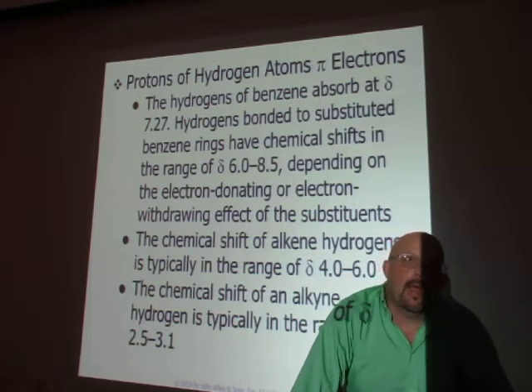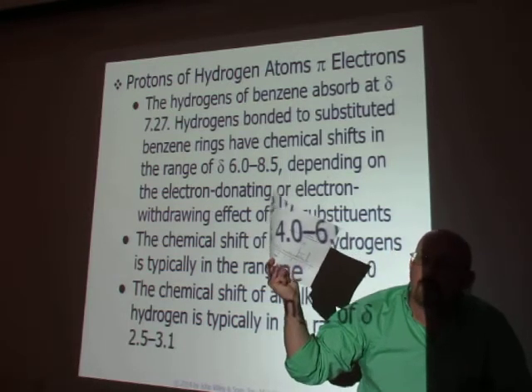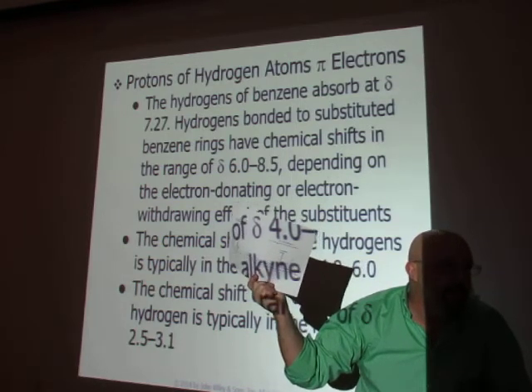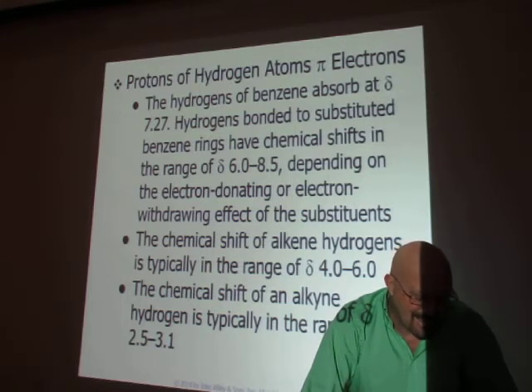So when we make a brand new compound in the lab, how do we prove that this molecule is aromatic? Right here is how you prove it. You go take an NMR. If you have protons down there in the aromatic region, then you know it's aromatic. This is how we prove whether a molecule is aromatic or not. Go take an NMR spectrum. If you've got protons in that 6.5 to 8 region, more than likely it's aromatic. That's giving you some proof that you have an aromatic compound.